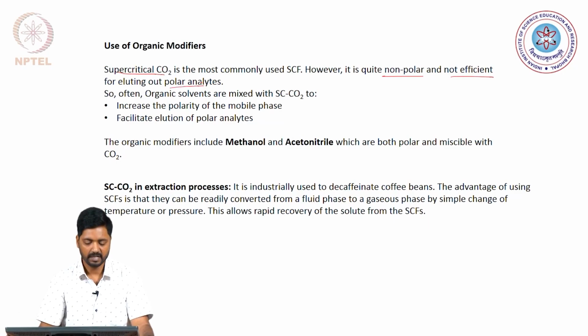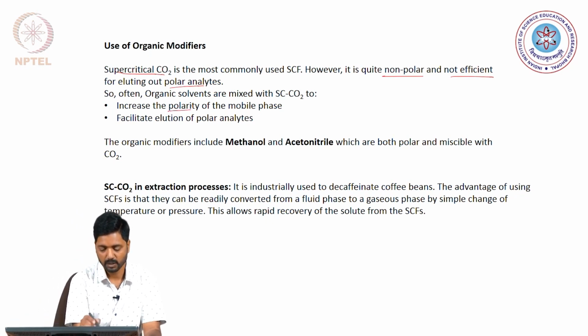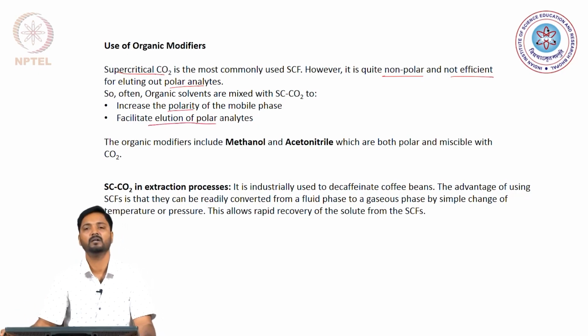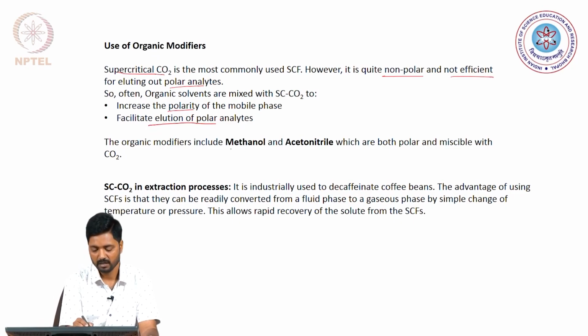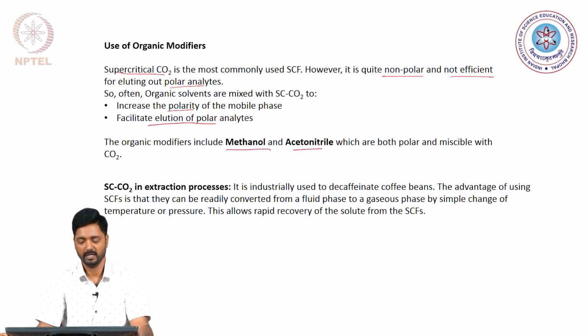So, we add organic solvents to make the supercritical carbon dioxide a little bit more polar, that is increase its polarity, and that will facilitate better elution or faster elution of polar analytes. Now, the most common organic modifiers or organic additives being used with supercritical carbon dioxide are methanol and acetonitrile, which are both polar and miscible in carbon dioxide.